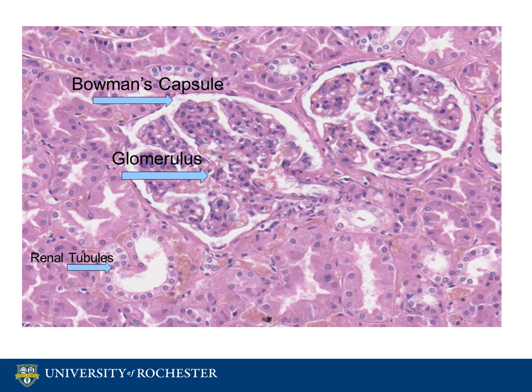Mesangial cells can be identified. These are a type of myofibroblastic cell which functions to support and regulate the glomerular tuft. We can also identify that there is flattened parietal epithelium which lines Bowman's space. From the capsular space, the filtrate passes through a channel into the renal tubule, which is a series of ducts in the nephron.